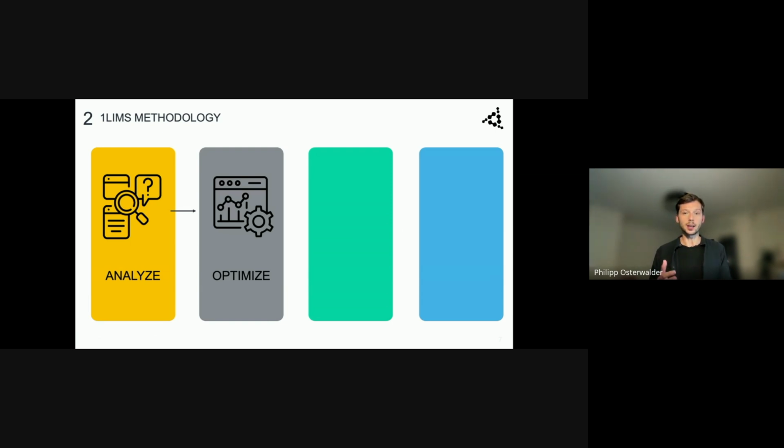That means it starts with the right mindset. And this is the basics we're also talking about in our lab check workshops together with a team, to identify early adopters and also identify leaders, which is necessary and crucial to lead this digitalization project to a success.